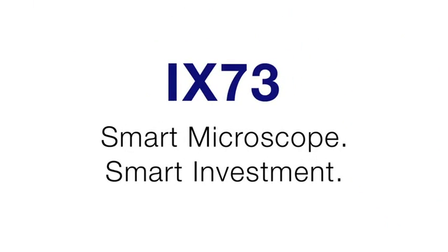Olympus IX-73, a Smart Microscope that's also a Smart Investment.